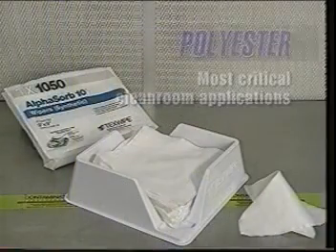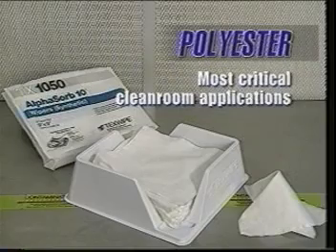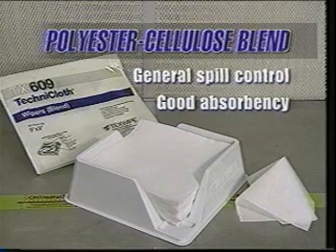For instance, if your work places you around semiconductor manufacturing or research equipment where minute amounts of particulates pose a threat to product quality and yield, a seal-edge polyester wiper would be your best choice. Polyester possesses good absorbency, the best balance of performance characteristics, and most importantly, leaves behind the lowest levels of particles and fibers. Also strong and absorbent are wipers made of nylon. Next in line, with somewhat higher levels of particles, are polyester cellulose blends.